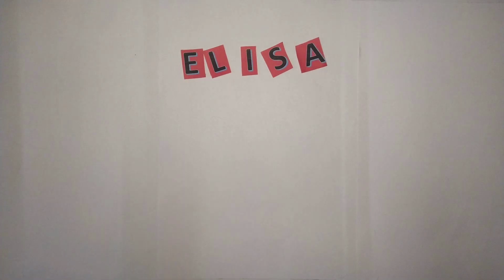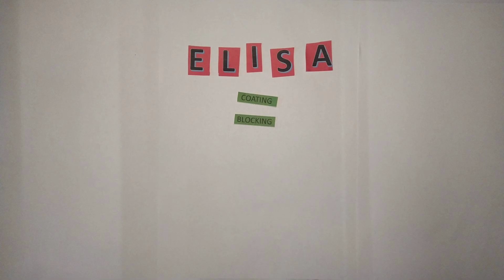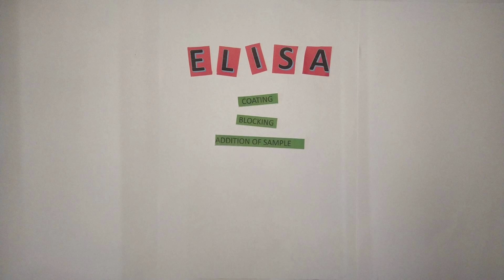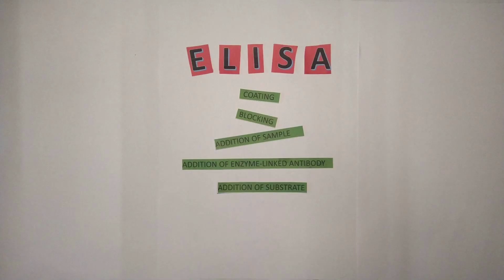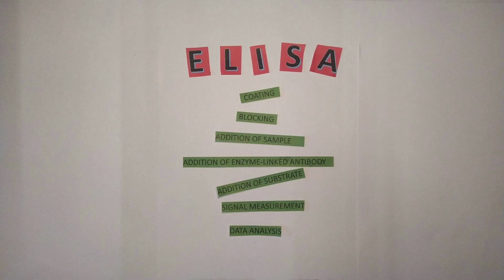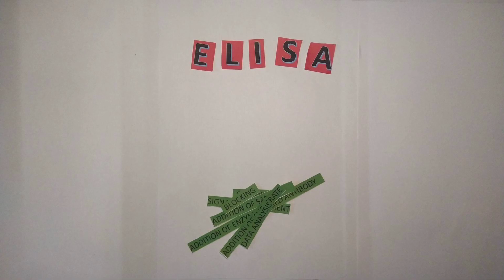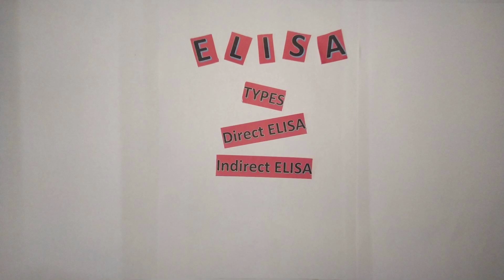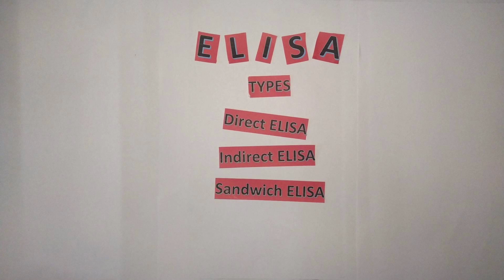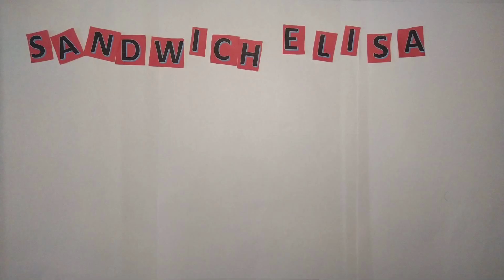All ELISA protocols contain the following steps: coating, blocking, addition of sample, addition of enzyme linked antibody, addition of substrate, signal measurement, and data analysis. There are four types of ELISA: direct ELISA, indirect ELISA, sandwich ELISA, and competitive ELISA. Now, let's learn about sandwich ELISA.